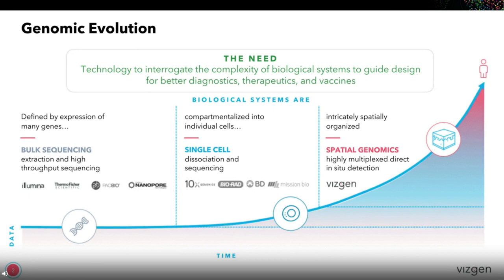As you can see from this landscape of genomic evolution shown here, from bulk RNA sequencing to single-cell sequencing, we can now interrogate the gene expression profile of individual cells and use this information to understand cell composition and cell-cell interactions. However, sequencing-based approaches have a fundamental limitation because they don't usually provide the spatial context of what you're looking at. To do the sequencing, cells either have to be destroyed or dissociated, and thus we lose the very rich spatial information for the 3D tissue structure.